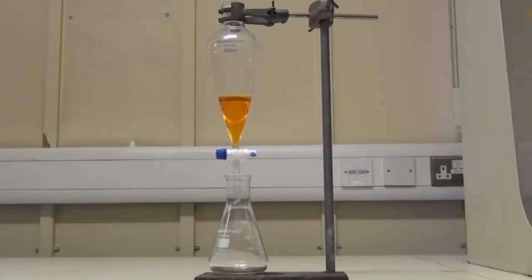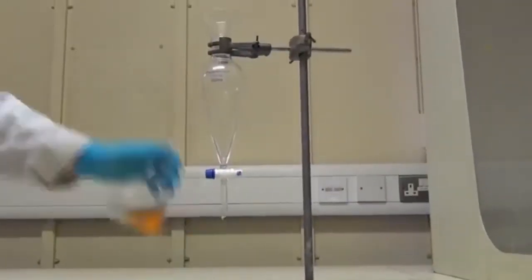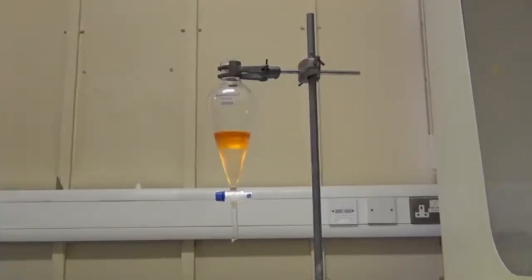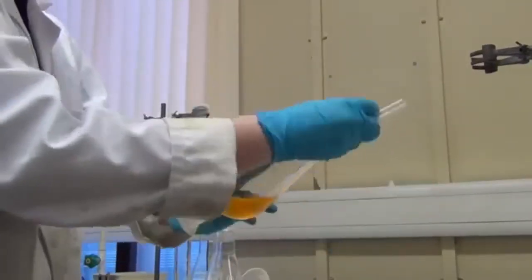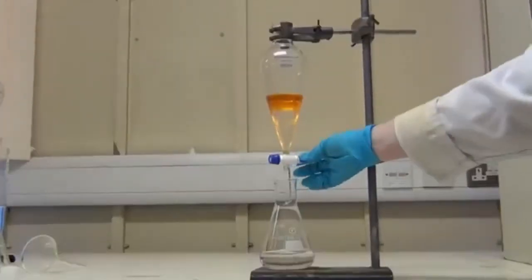Put this conical flask to one side and collect the remaining layer into a new clean conical flask. To obtain the most accurate results, it is best to repeat the whole process twice more, by pouring back in the layer you wish to extract more from. In this case, we want to extract the organic orange layer, but this is not always the case. You add new extraction solvent from a measuring cylinder, not from the layer you have just extracted into a conical flask.